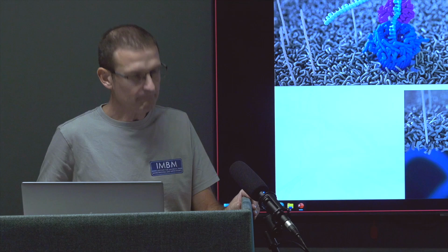Stupid question, but how many samples are you putting in there in one go? You can multiplex. You can put up to 96 samples together. And each one gets a unique barcode. So after the fact, we can pull them apart.